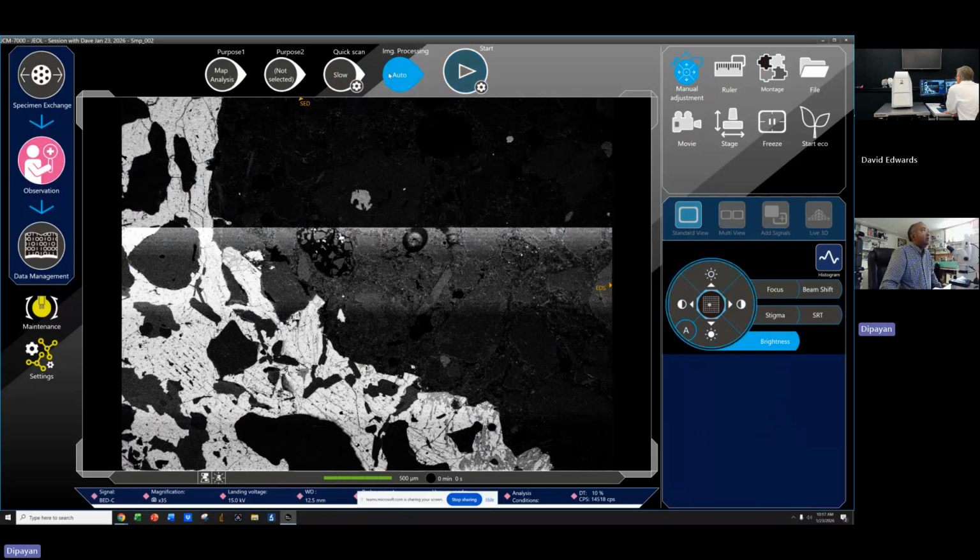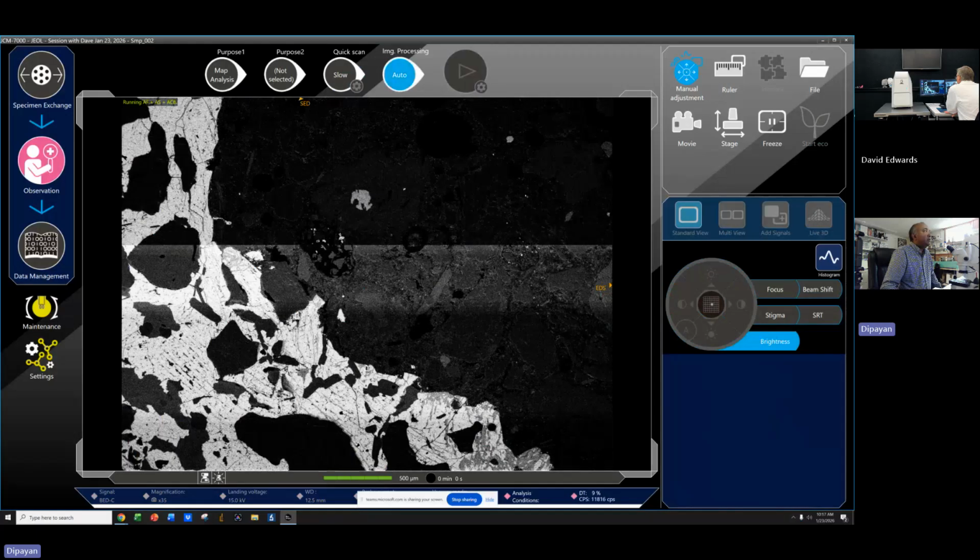Oh wow, it is really dark. Let's do an auto quickly. Okay. So it looked to me like you had a good brightness and contrast for a minute there. Why did you go to auto? It was kind of too dark for me, in this area.